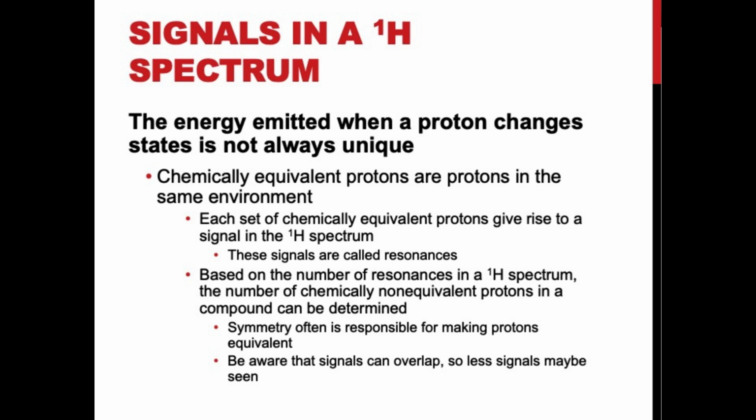So being able to look at a molecule and know how many signals you are going to have is kind of the first step of being able to know if you've made the correct compound or not. Because you can say, okay, my molecule should have 6 types of hydrogens, and then you look at your NMR and you see 6 signals. That's pretty promising that the types of hydrogens match. Then you can get further into analyzing the NMR to make sure you have the right stuff.